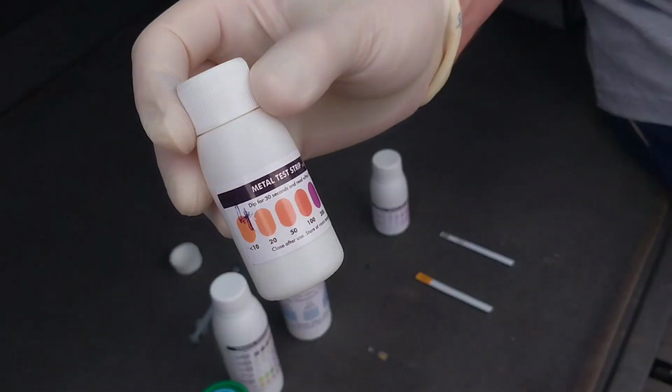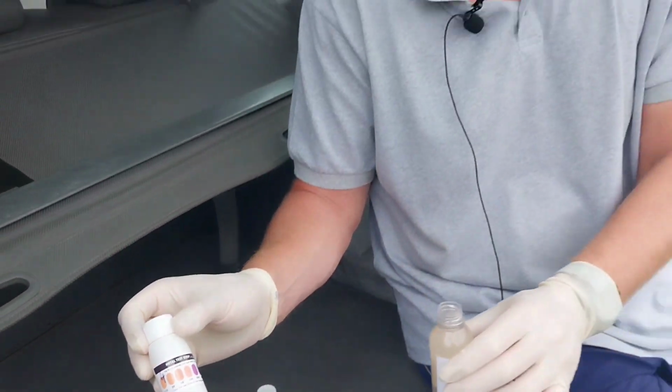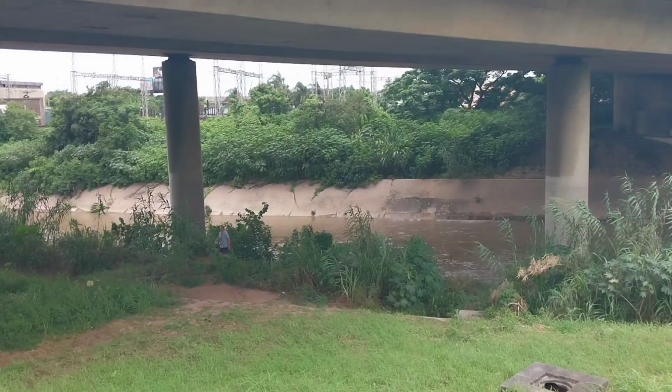Any type of metal, like nickel, magnesium, any type of metal that you have in the water system, it will reflect here. So when you get into more detailed testing, you can actually start testing for those particular compounds. But this is obviously a citizen activist kind of water testing kit, so we try and make it as simple as possible. So lastly, nitrate and nitrite. Once again, kind of compounds that you'll find in fertilizer.